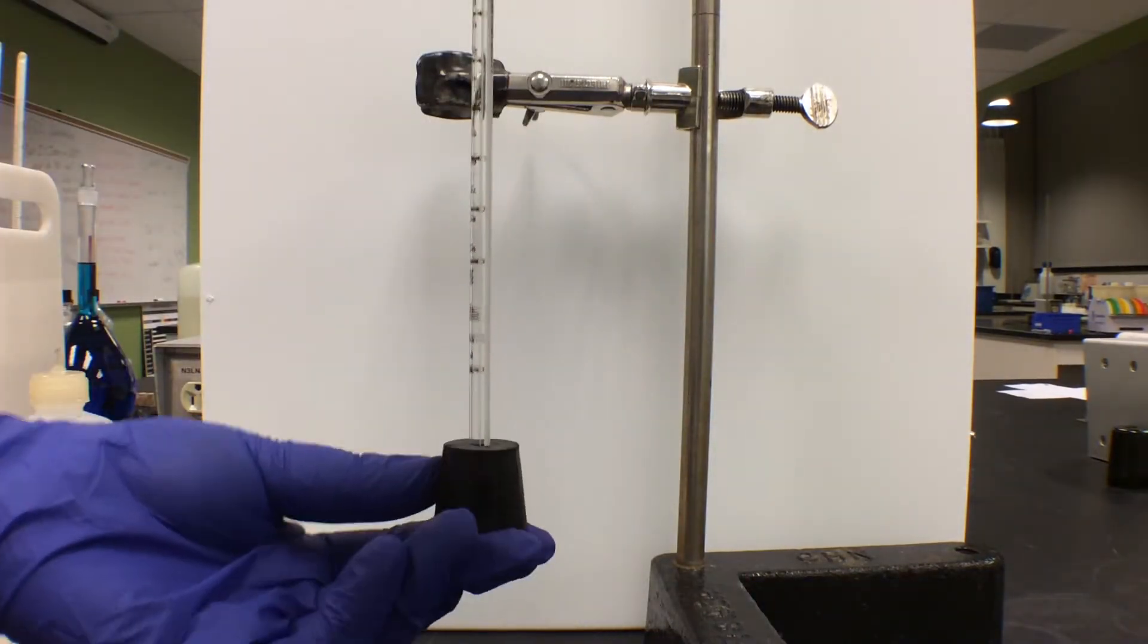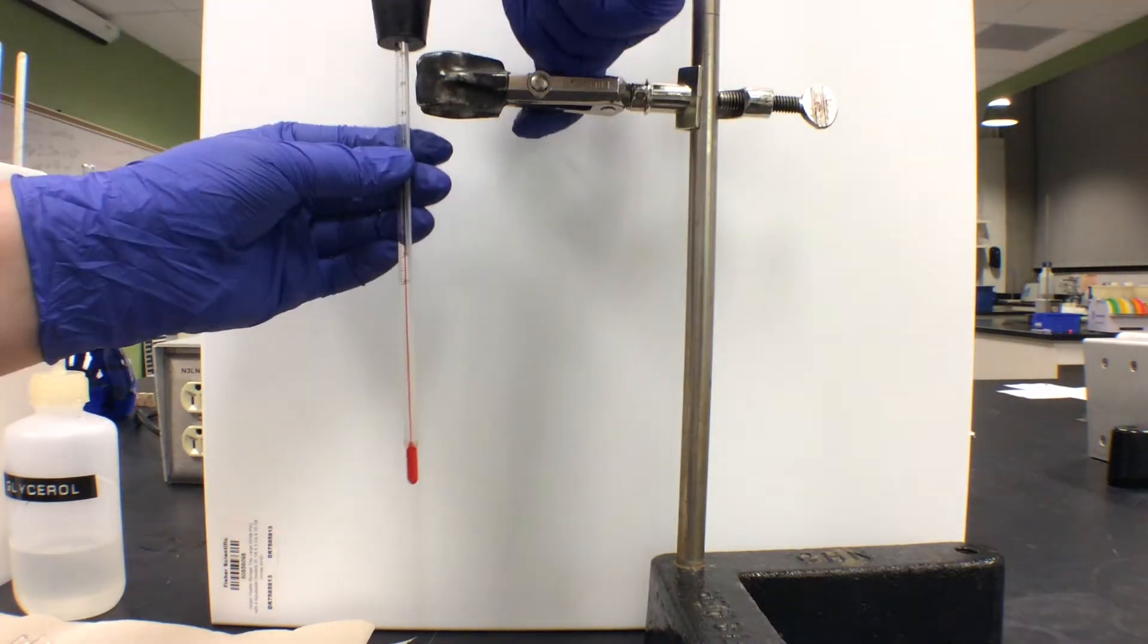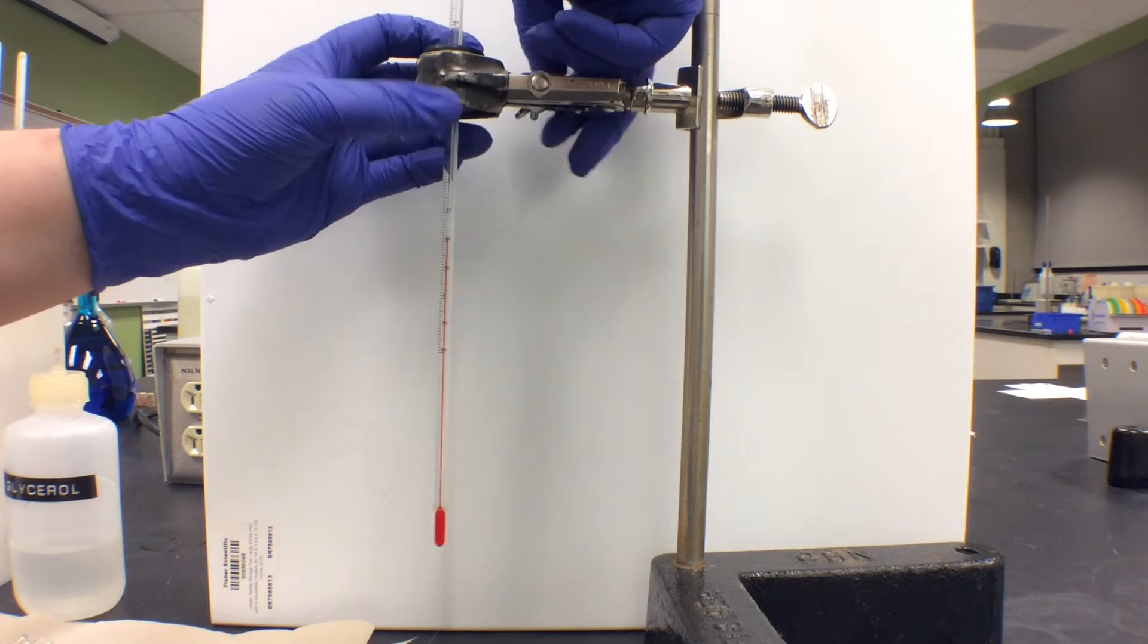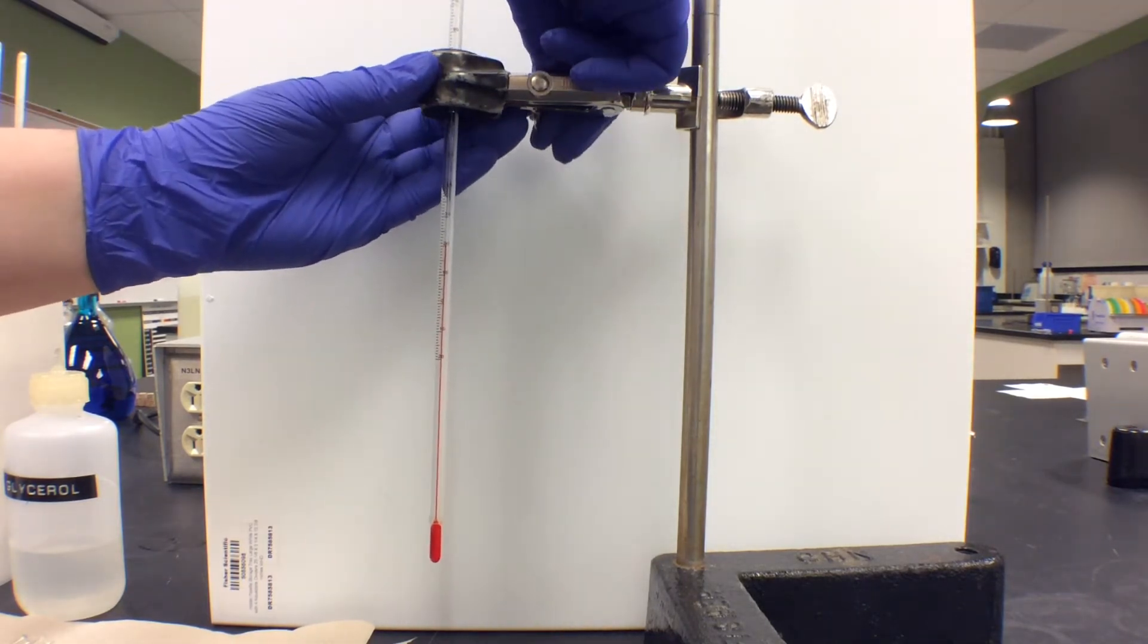After inserting the thermometer, place the stopper in the utility clamp and secure it in place. Don't tighten the clamp too much. The thermometer should be perfectly vertical once the stopper has been secured.